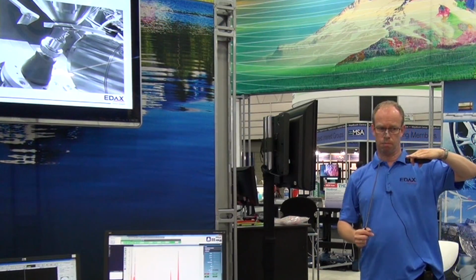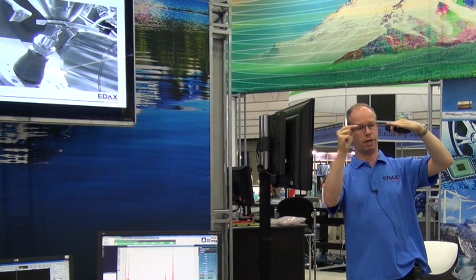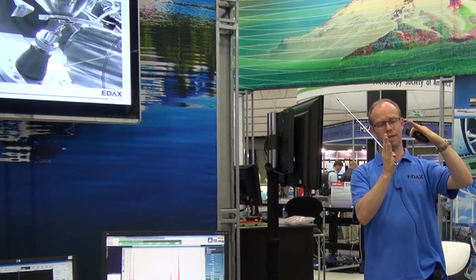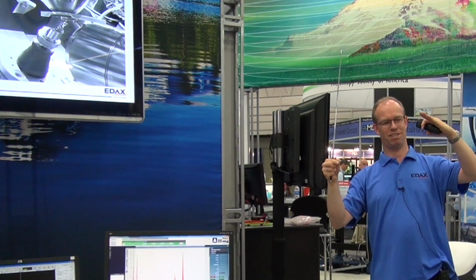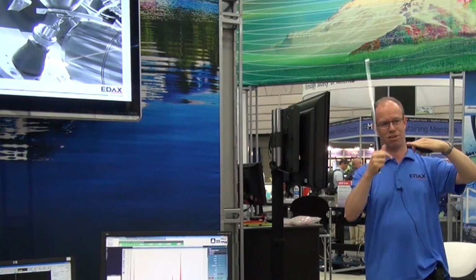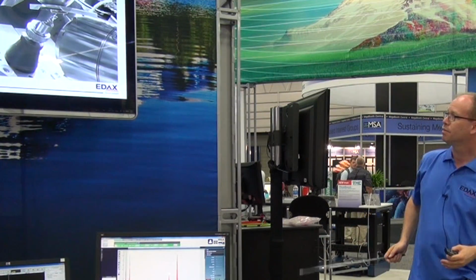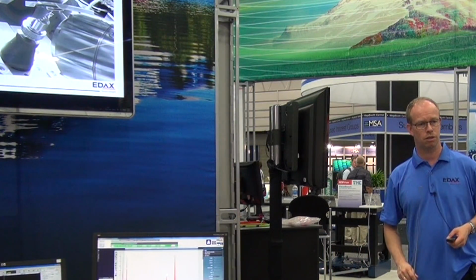If you go horizontal and you have your EBSD here, then you have very, very little signal at the top of your screen. If you tilt a little bit, let's say from a normal EBSD position you tilt 20 degrees, then the electron path in the sample is the shortest. If you tilt less, then you have a little wedge of material that the electrons have to go through in the sample again. So it's not the entry point, it's the exit point that defines the spatial resolution. So if you go anywhere between typically 20 to 40 degrees, you can get really good data.